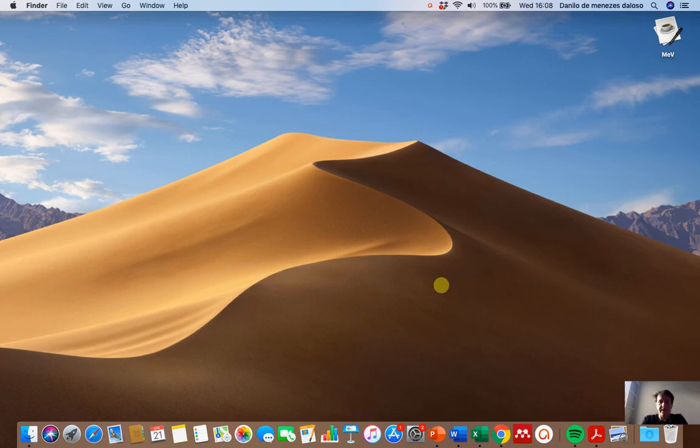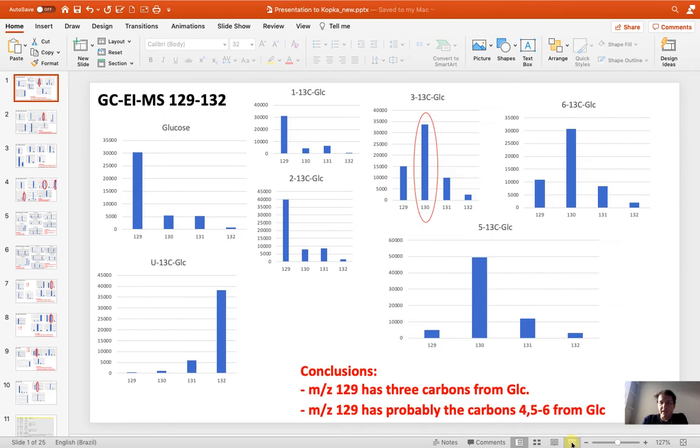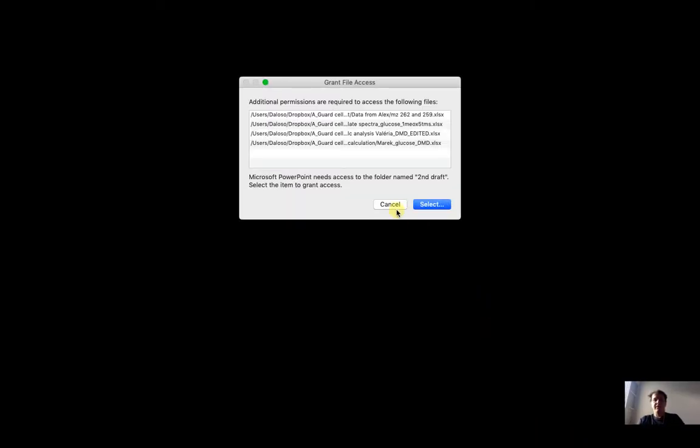Hi guys, I'm recording this video to show you all what we have done in this last month regarding the glucose labeling analysis. I decided to make the video because it's too many things for a meeting. Then you can watch and take note of your questions and send them to me, or we can schedule a meeting to discuss other things.